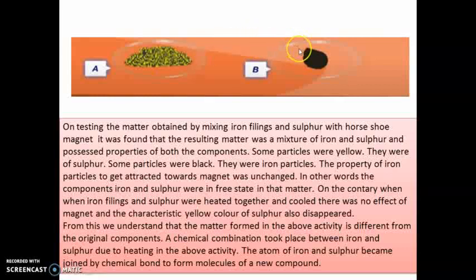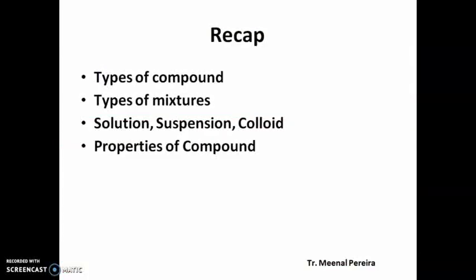From this experiment, we see that in the mixture, iron filings and sulfur retain the properties of both components: the yellow color of sulfur and the magnetic property of iron. But after heating, a chemical combination takes place between iron and sulfur, new bonds are formed, and a new compound — iron sulfide — is formed with entirely different properties. It is neither yellow nor does it get attracted to a magnet. The properties of the compound are entirely different from the elements that formed it.